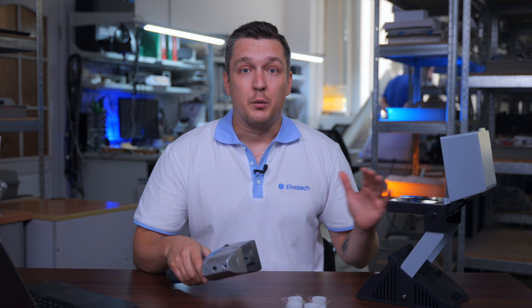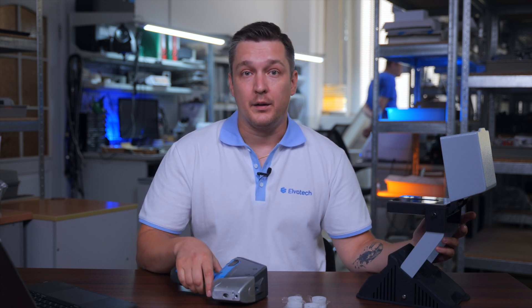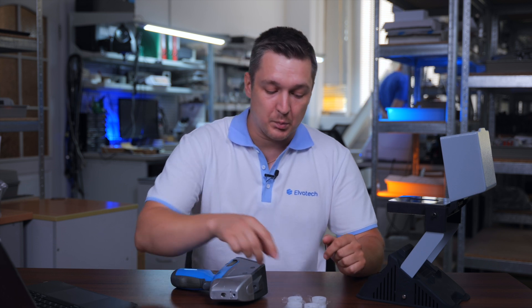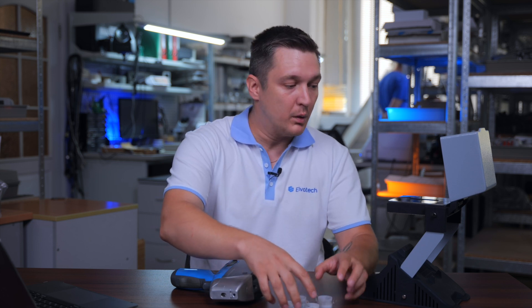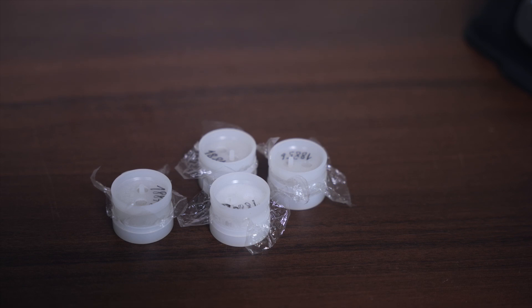Now that our equipment is ready, let's move to preparing the sample cups for analysis. As you see, we have already prepared the sample cups with the cement and we will put them into the lab stand and analyze our samples.